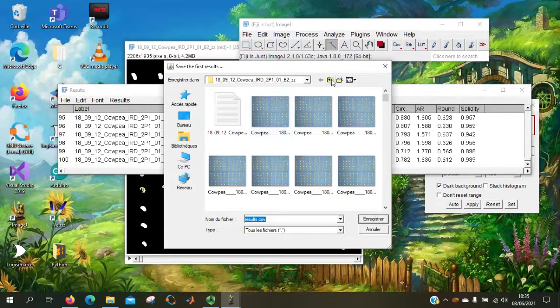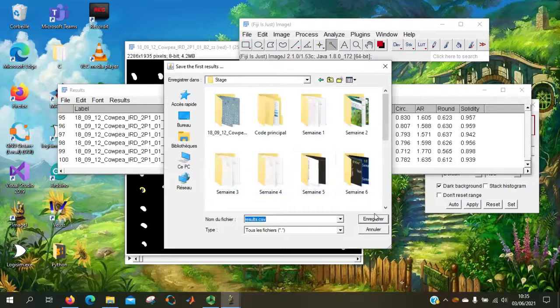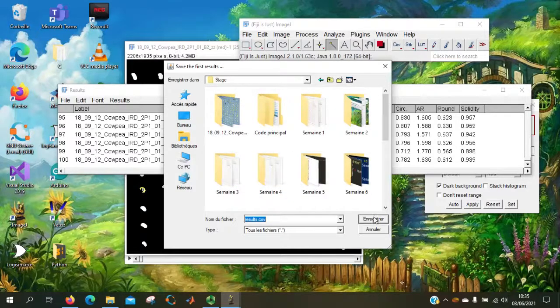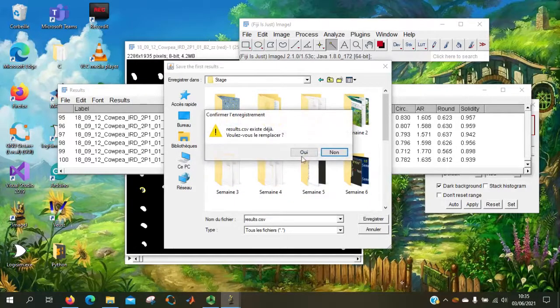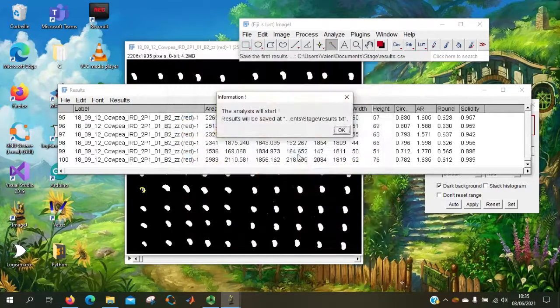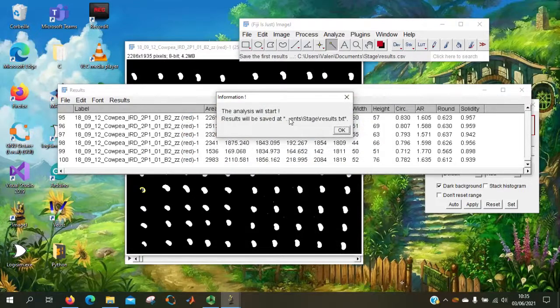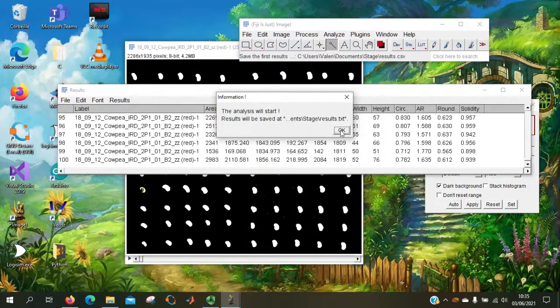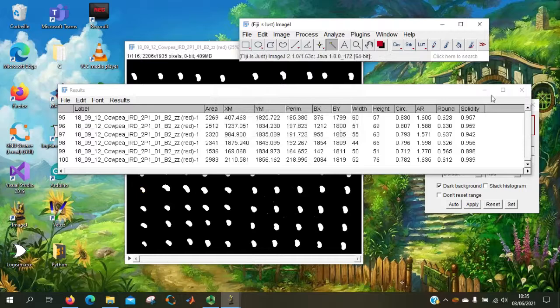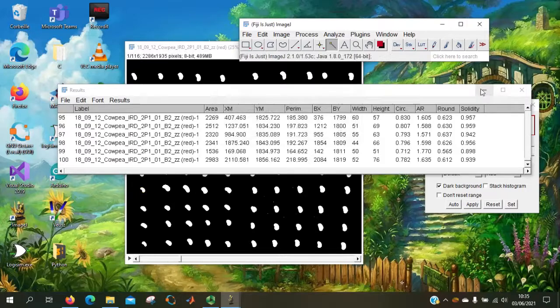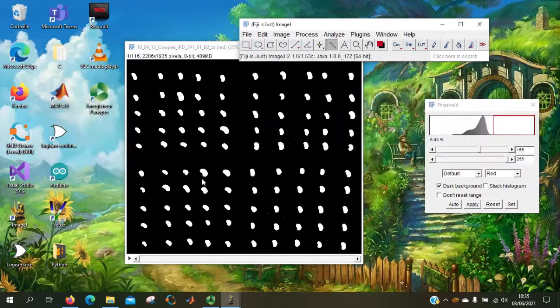So it's okay. We can save the results here. Yes. The analysis will start. So here it goes.